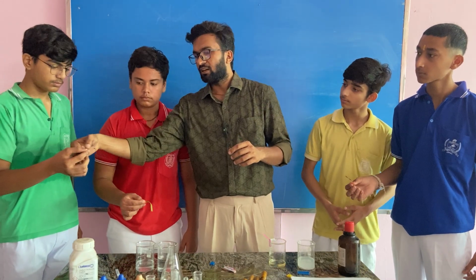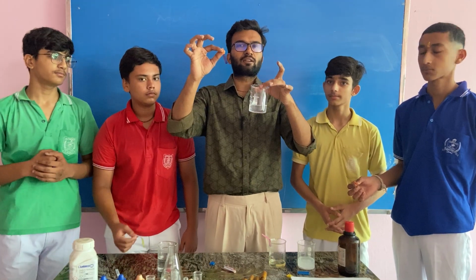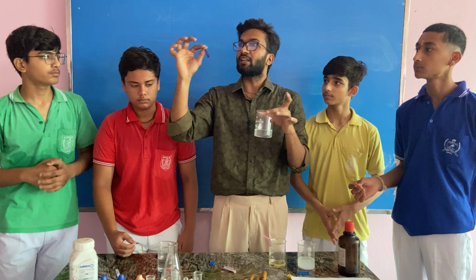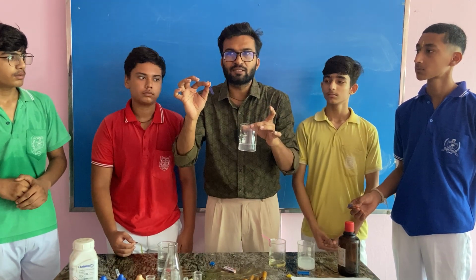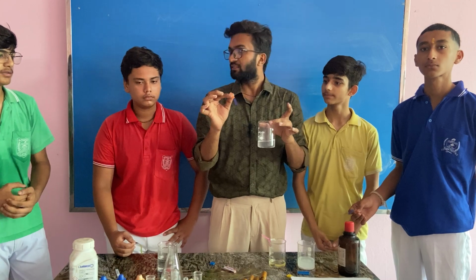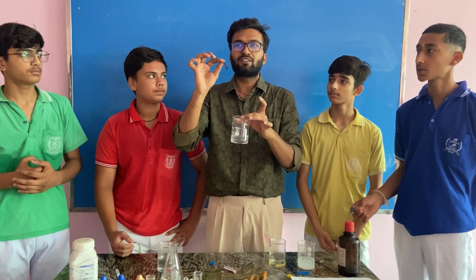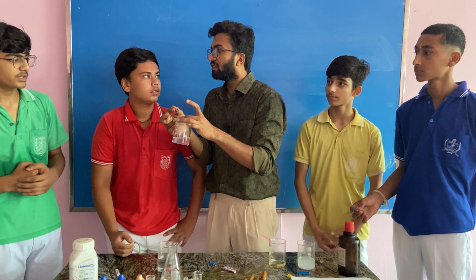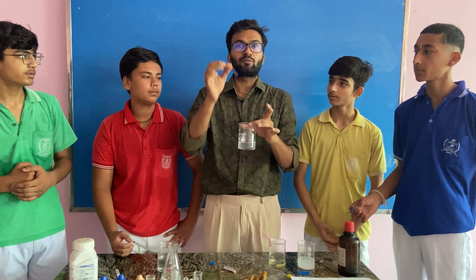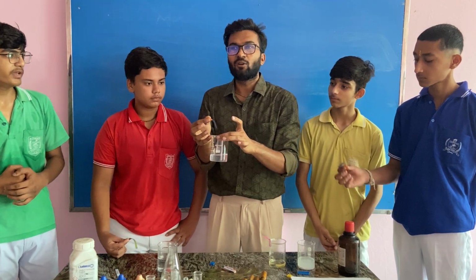First of all, in the first solution we got a blue color and it is dark blue, it is navy blue. Okay, then what is the nature of this substance? It is the base. And is it strong or weak? Strong. Okay, why is it strong? Because its color is dark blue. If it is light blue, then it is a weak base.